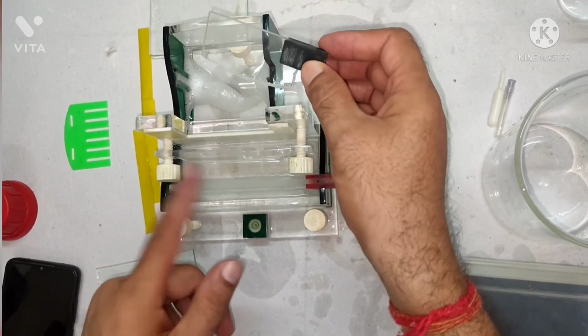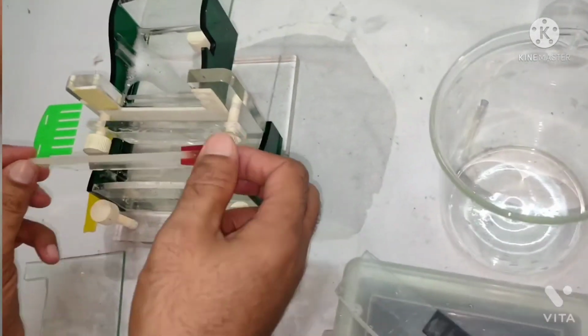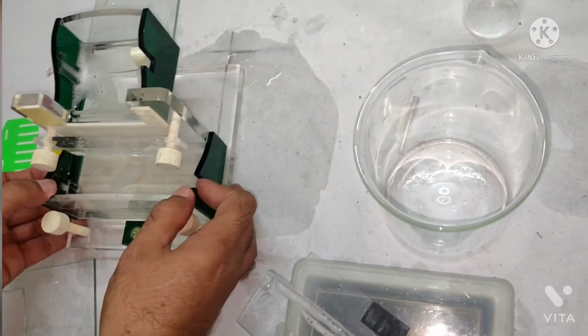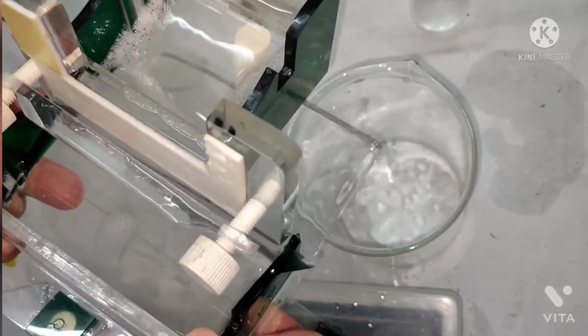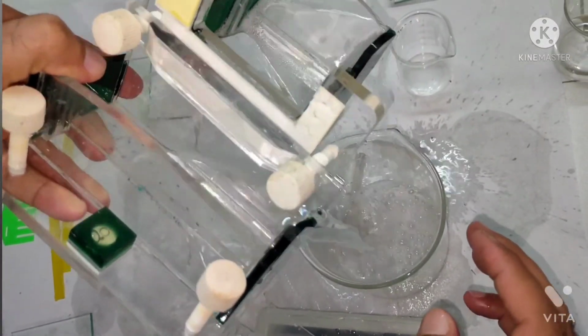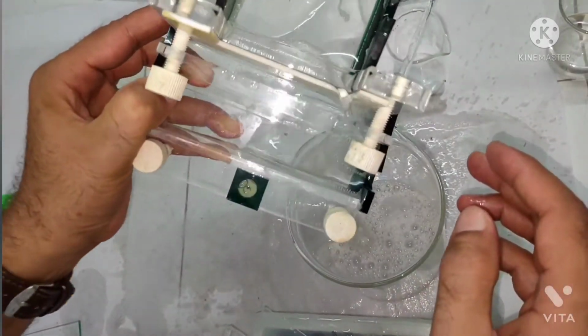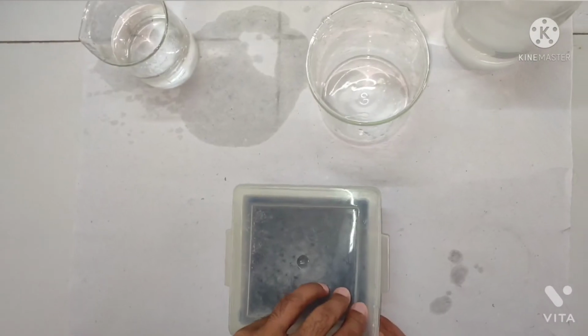So now one can use this tank buffer 2 or 3 times, right? So I'm just preserving this buffer. You can just pour this buffer carefully into some container, whatever you have, so that you can use it again and again. I mean, at least 2 times we can use this buffer very easily.